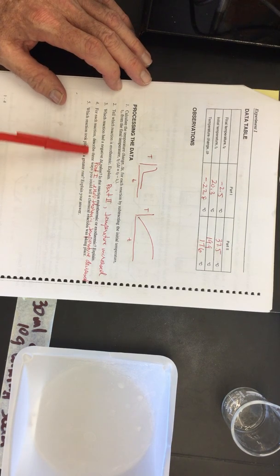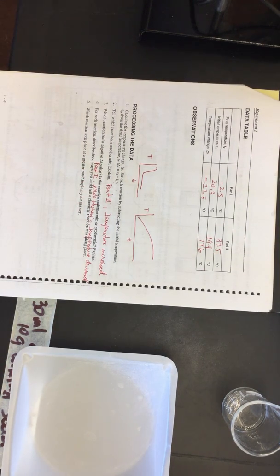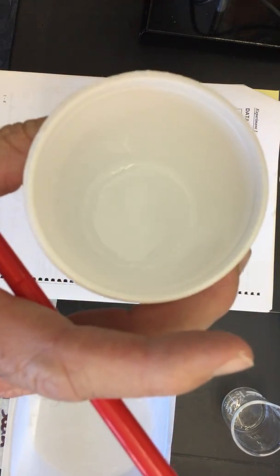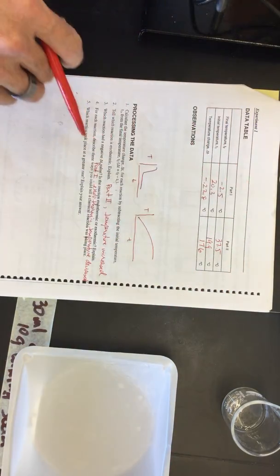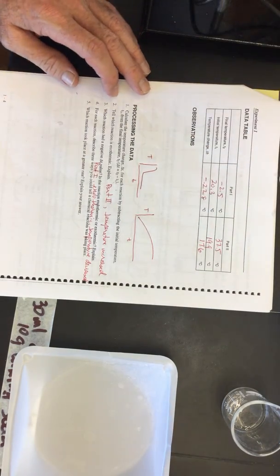For each reaction, describe 3 ways that you could tell a chemical reaction was taking place. Did you guys see anything during the duration of that? You can actually still see it right here. You might be able to hear it. There's bubbles. Okay, bubbles was taking place in the other one. The hydrochloric acid completely dissolved the magnesium.